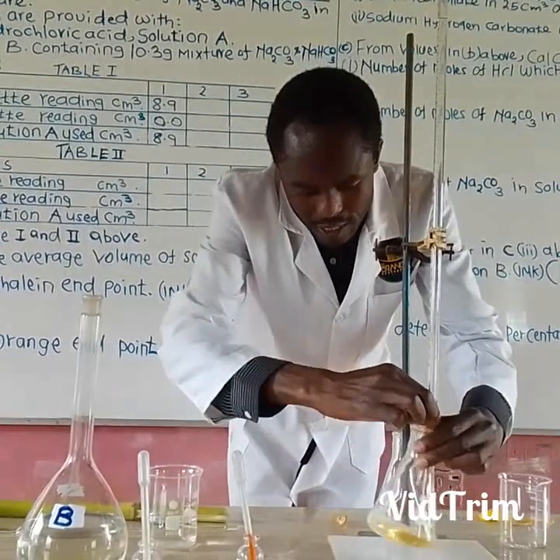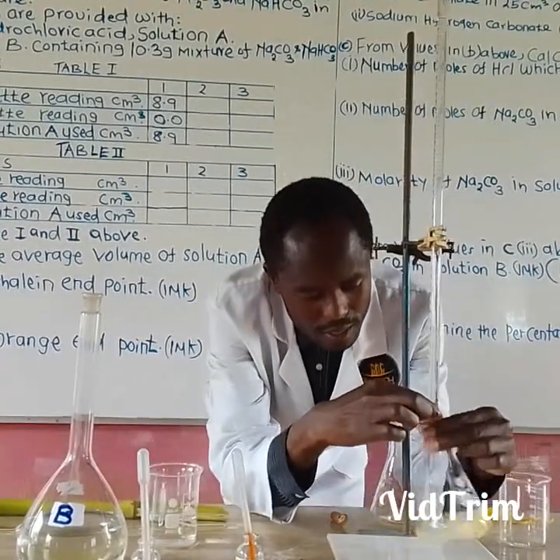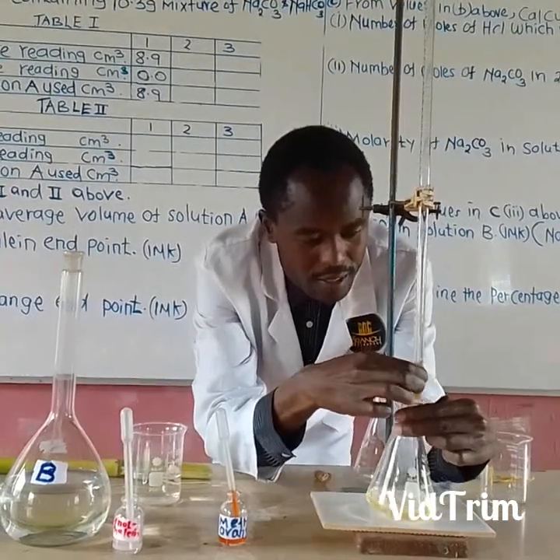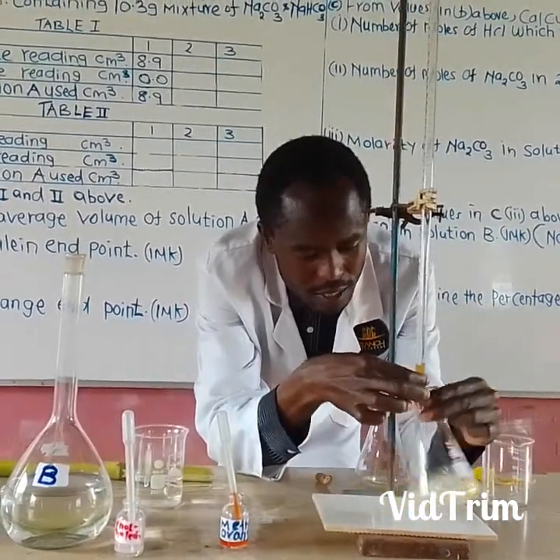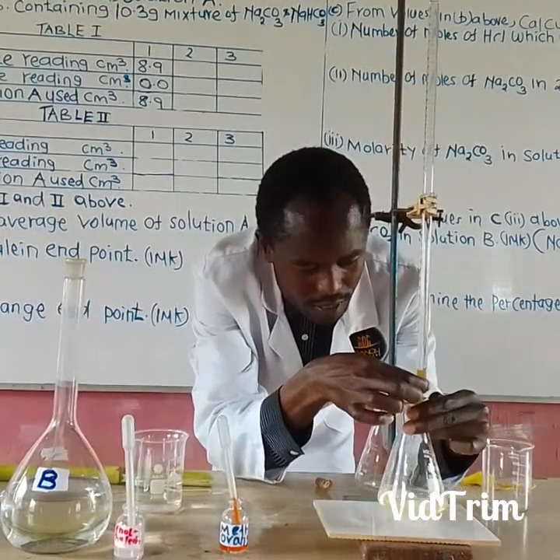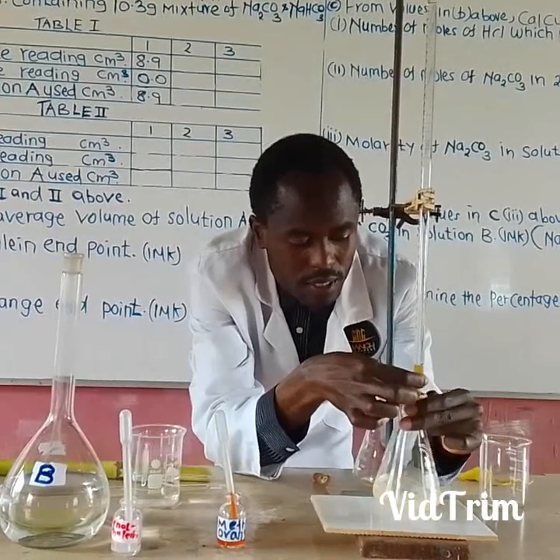And as you titrate, you have to swirl the solutions. So I have to swirl like this. As I titrate, I have to swirl.